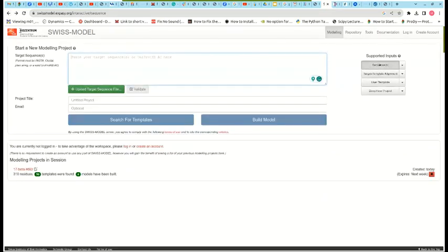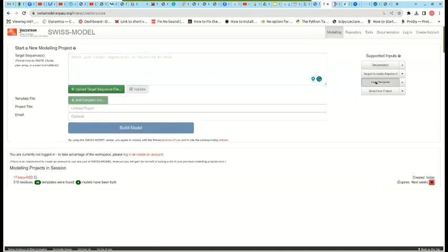You'll see on this interface where I have now that, so the essence of blasting is for us to see if we can get a protein that is close or similar to our own protein that has been crystallized already and is already in the protein data bank. So if we, through the blast, get a protein that is actually similar to our own that has been crystallized, then we'll just use these user templates, and that will give you the opportunity to upload your own templates.